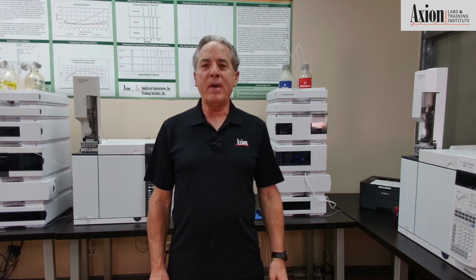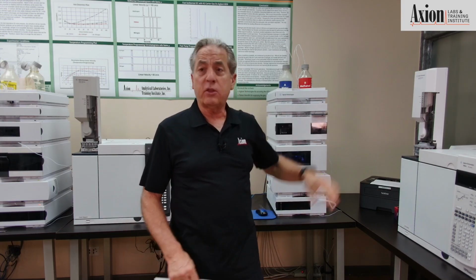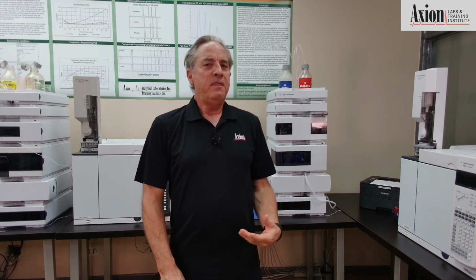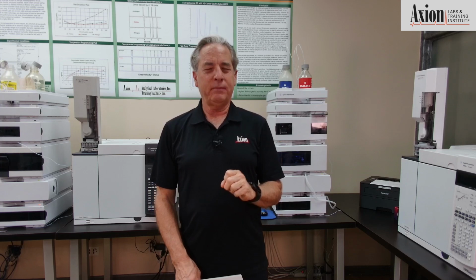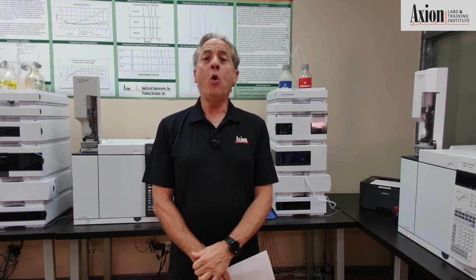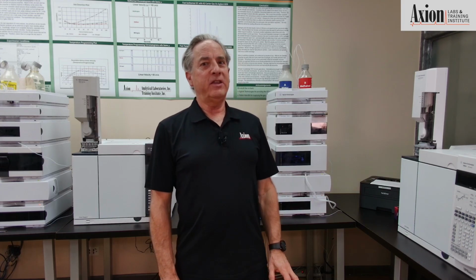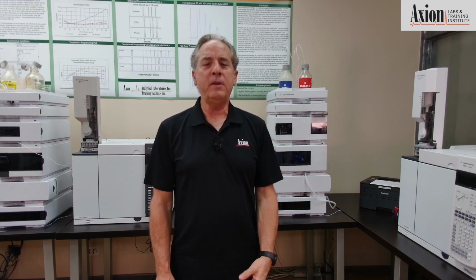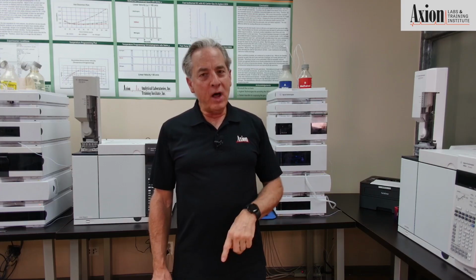And to me, the biggest mistake people make is on a typical Agilent GC with the 7683 type autosamplers, which I got all over the place, really common out there. They have a turret, and the turret can either handle only one sample, called the transfer turret, or it has a sample turret, which can hold up to 8 samples. Now, if you get the newest autosampler, it does up to 16, but we're talking sort of the 7683. So it has 8 samples. Those are labeled 101 through 108.